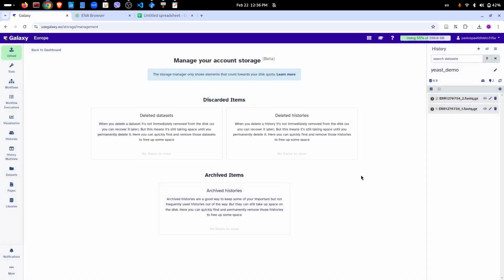and Close. Now what's happening is that I gave a command to Galaxy to upload these files from ENA, from the URL that I pasted there. Quite often the Galaxy server is busy, and therefore it puts my job on a queue. That's why you see this clock there, telling me that I should wait for the job to start.